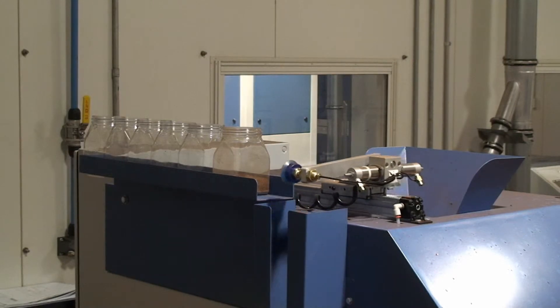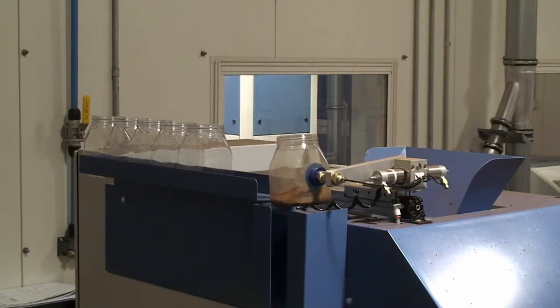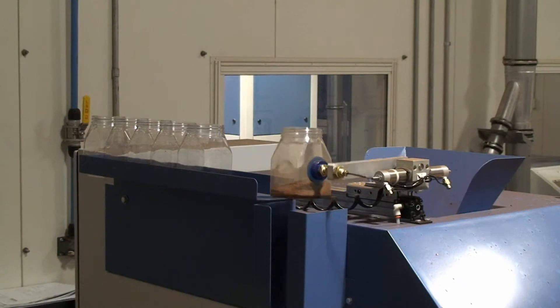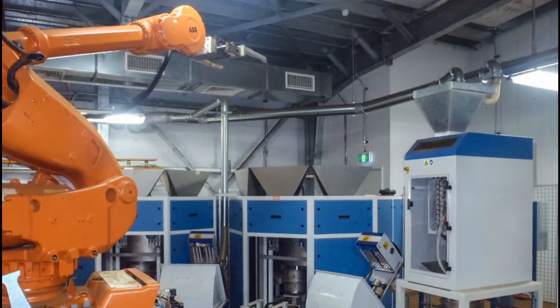Up to six samples in a row can be processed automatically by the machine, or it can be integrated as part of a larger automation system and fed via a robot.